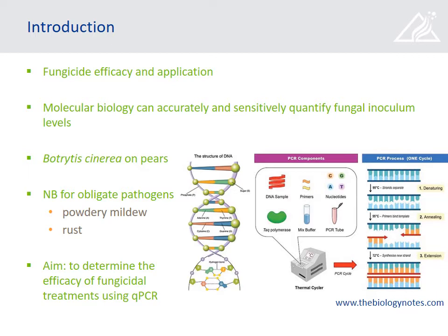Working with DNA, obviously we need to build in a time scale, and based on the amount of growth, whether it is vegetative or reproductive, after application of the fungicide, we can then use that to see if the fungicide was effective in inhibiting or killing the spores from the start.